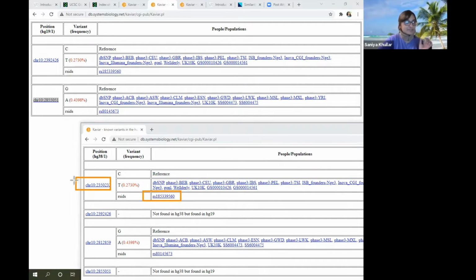And this is very different. It's the same SNP, this and this, that's the same. So between the builds, HG19 and HG38, the same exact SNP is there. This is the same. But what's different is that these coordinates are different. These are not the same.